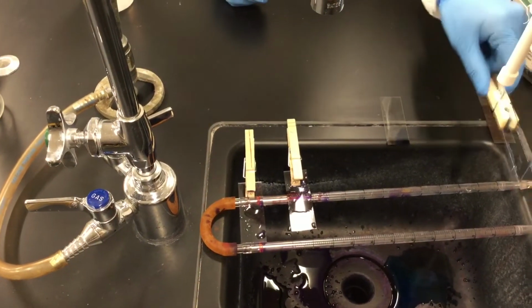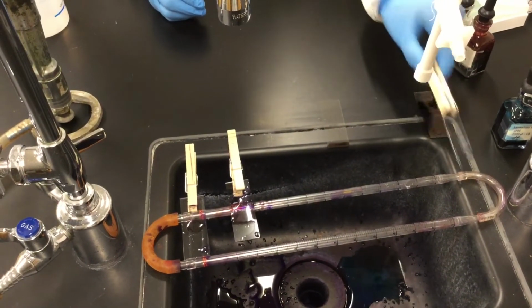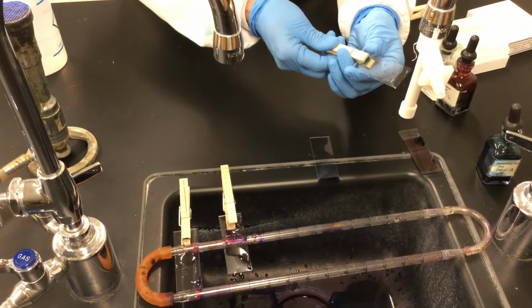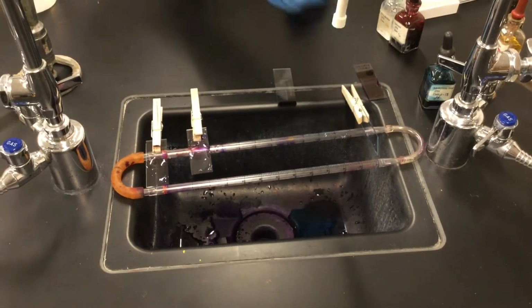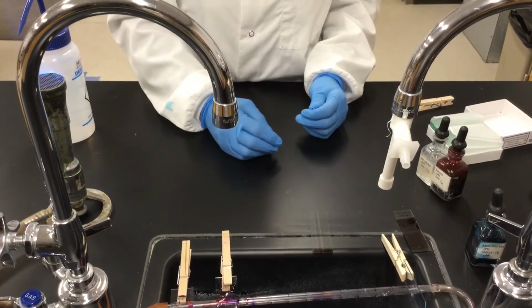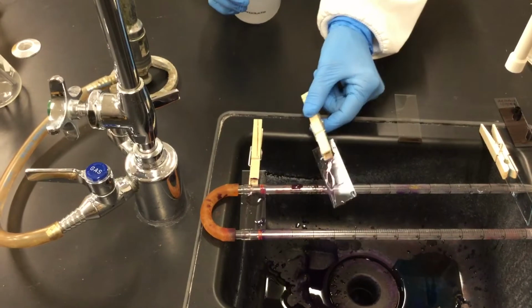And while that minute happens, you can start also shaking the excess off from your slides. There is one way you can use to let it dry much faster. It's by using paper, bibulous paper, in which you put them on the surface and then you just dab it like this. But sometimes it's much better to just do so by air drying the slides. That way you don't physically separate the bacteria from your slide.